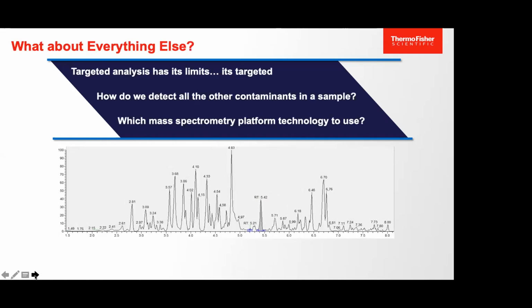So this is a very quick example for a short run, a 10 minute run. Okay. So how are we going to detect each of them? Which one is actually a natural product or which one is actually a toxic compound?